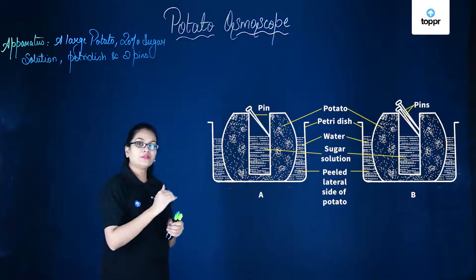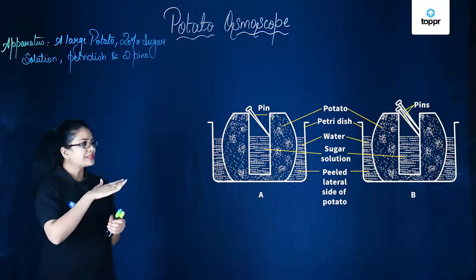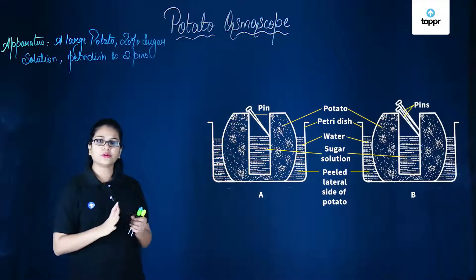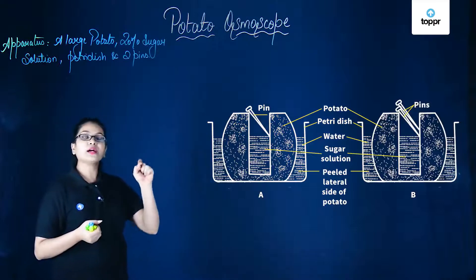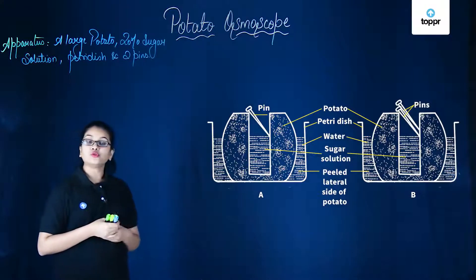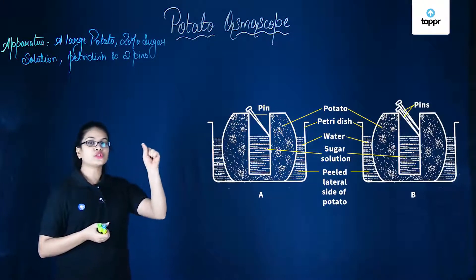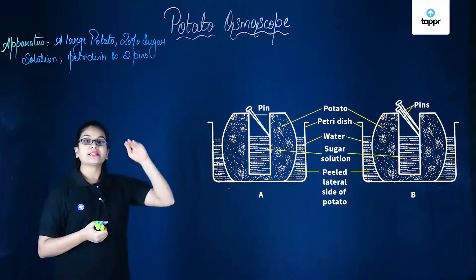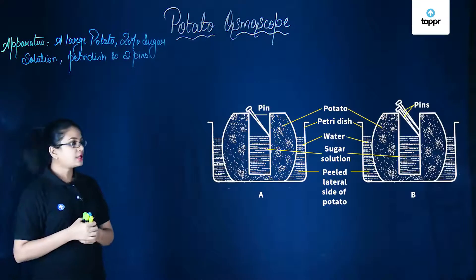Inside the cavity of this potato we will add 20% sugar solution, approximately half or around two-thirds of it. Next, the level of this sugar solution will be marked with the help of a pin. And after some time, you will notice that the level of this solution inside the potato has risen. Let's mark it again with the help of a second pin.